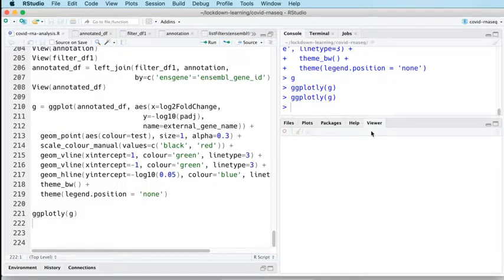What I'm going to do is a heat map of our differentially expressed genes. So our 141, I think it is, differentially expressed genes. And we're going to look at the expression of those differentially expressed genes across our 6 samples that we're working with.